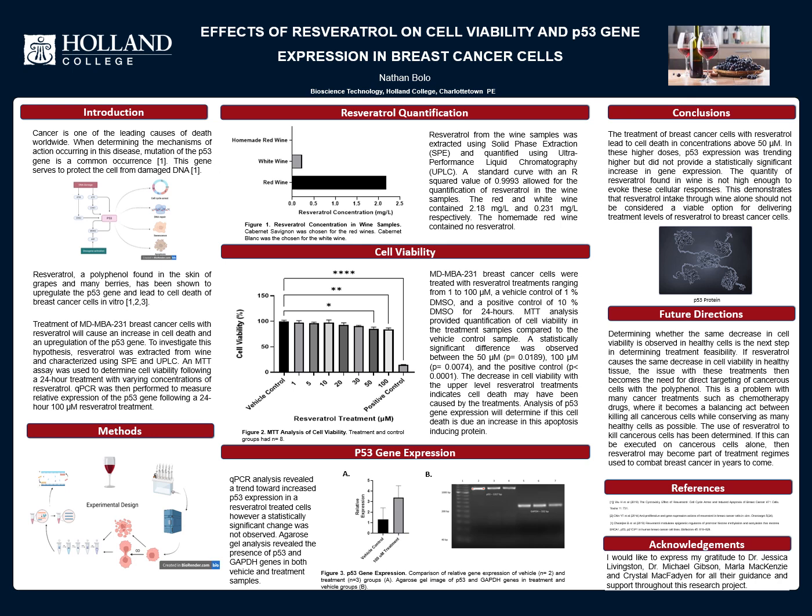Cell viability analysis can be viewed in Figure 2. A significant decrease in cell viability was determined in the 50 and 100 micromolar treatments when compared with the vehicle control group. Figure 3, seen on the bottom, displays the relative p53 gene expression comparing the vehicle control to the 100 micromolar treatment. Although a trend toward increased expression was observed, no statistically significant difference was detected between the two groups.